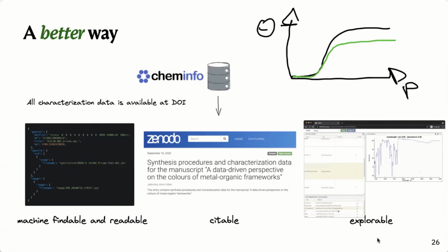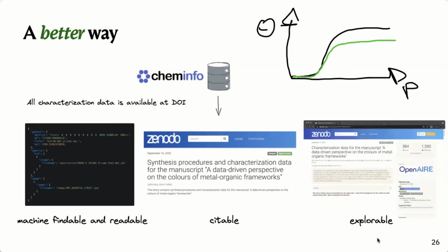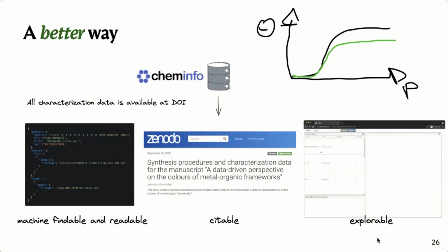But of course, it's hard if you're a bench chemist, you want to install some codes and run simulations, even though you need this data to really extract all the insights you have in this isotherm. So what we do is we just make this routine simulation routine again by adding a button in the ELN to get this for you.